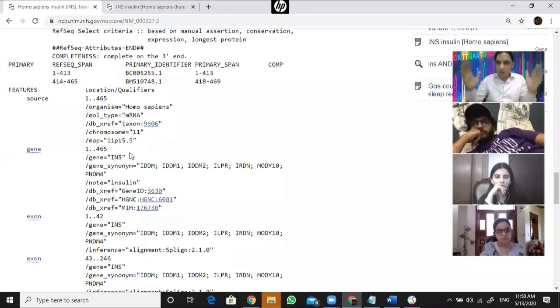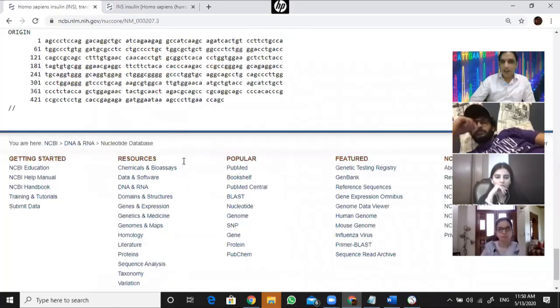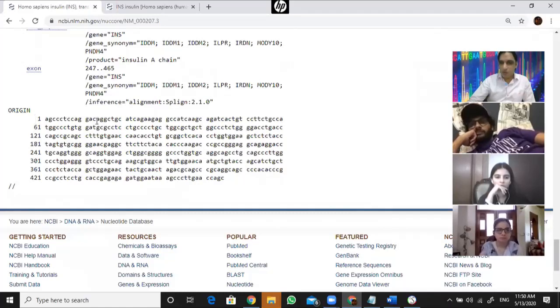That makes sense. Everything is a gene. And where is that everything? The everything is here. Look at that. At the end of the page, there is the sequence of that gene. It was divided into fragments. Each set contains 10 base pairs for easier counting. So this is like the base pair number 1. And this one should be the 10, 11, 20, 30, 40, 50, and this one should be the 60. So guess what? This one will be the 61st.